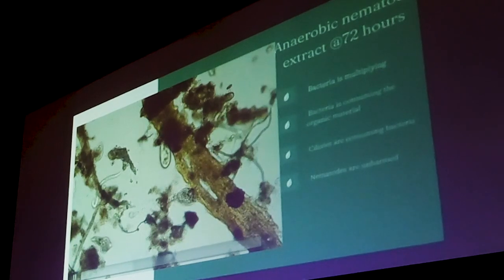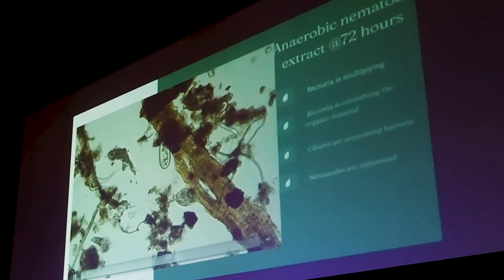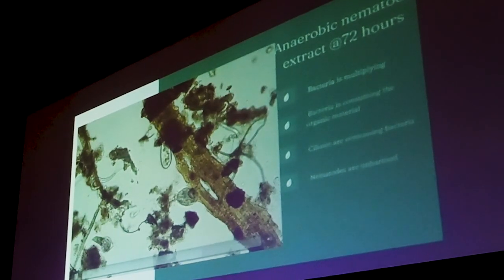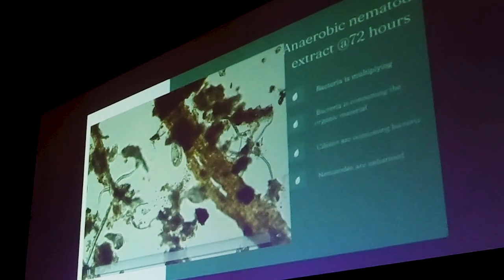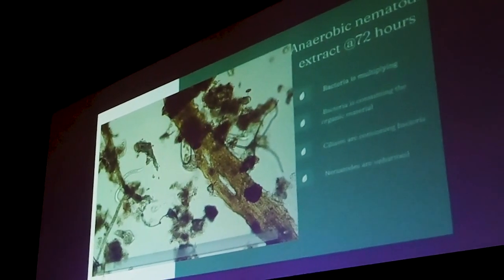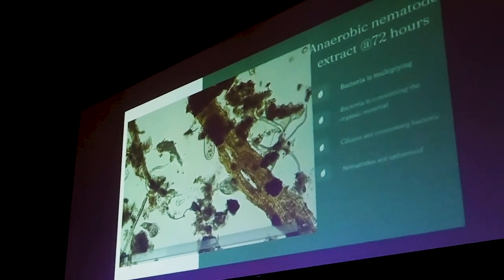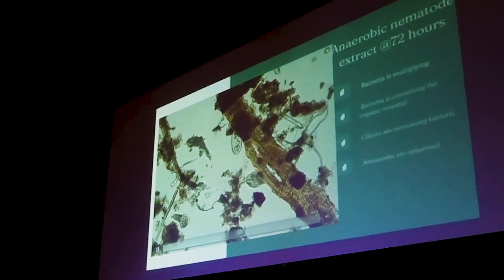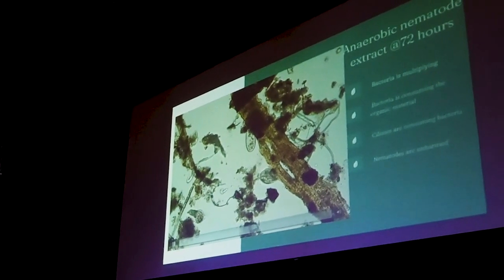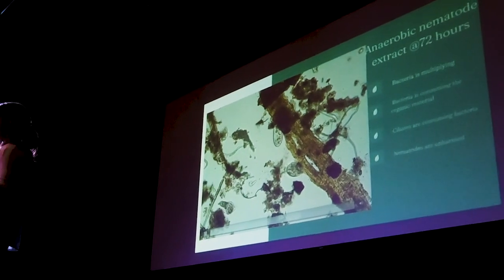What I want to point out is all the organic material that's still around. And I want you to look at that fuzziness. There's a fuzziness around everywhere. Kind of the bacteria have started to come together, and what they're getting ready to do is eat, and then they're going to go dormant. And so they're covering the surfaces of the organic material and they're breaking it down and then they're reproducing at a rapid rate. And so you're seeing those ciliates woke up in response to that. They're like, oh yes, bacteria, let's have a snack.